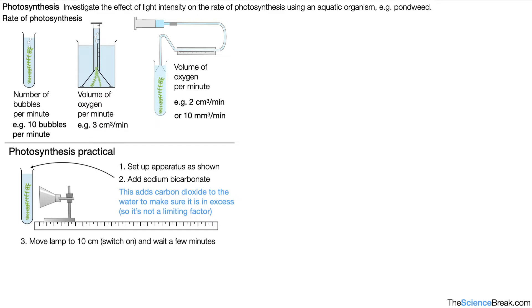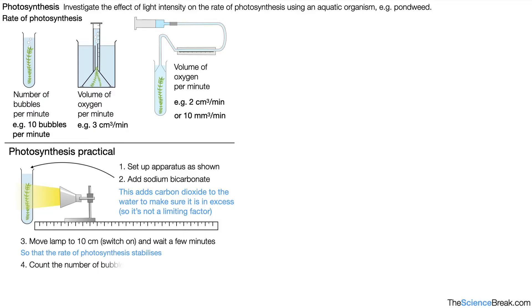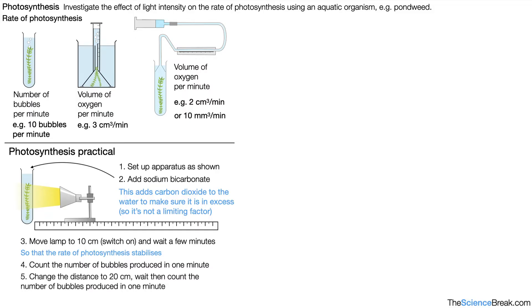We move the lamp to 10 centimeters, switch on, and wait for a few minutes so that the rate of photosynthesis stabilizes — it takes a minute or two for that. We then count the number of bubbles produced in one minute. We change the distance to 20 centimeters, wait, then count again. We repeat this for five different distances.